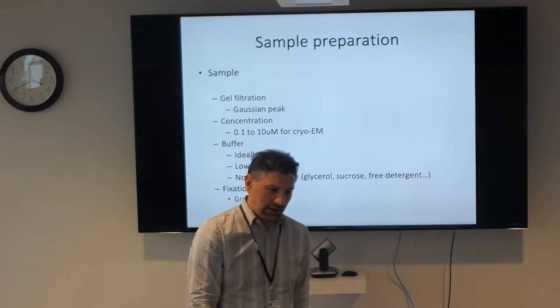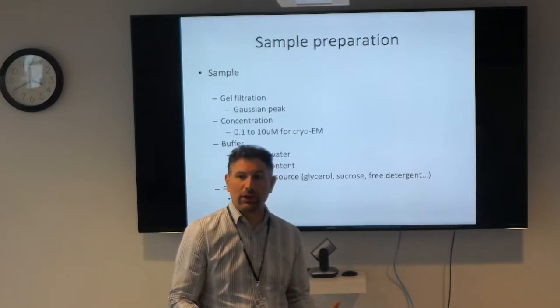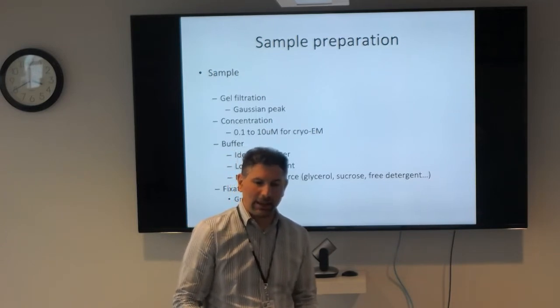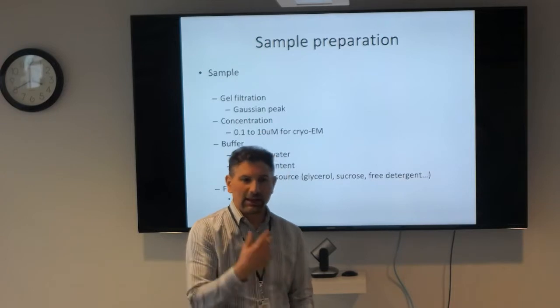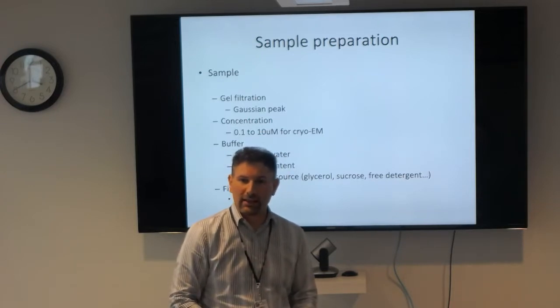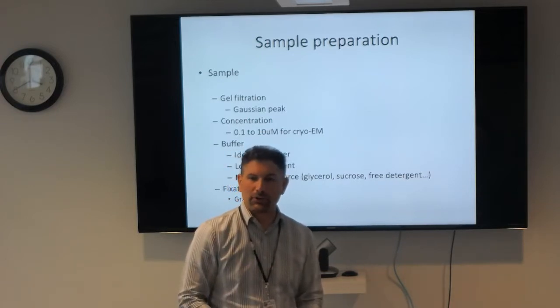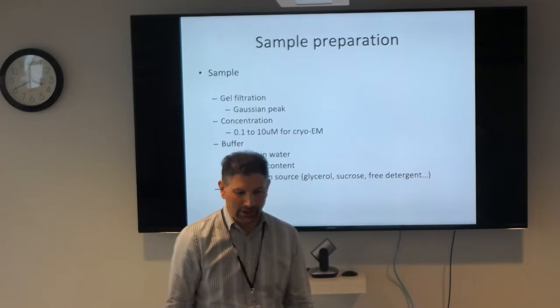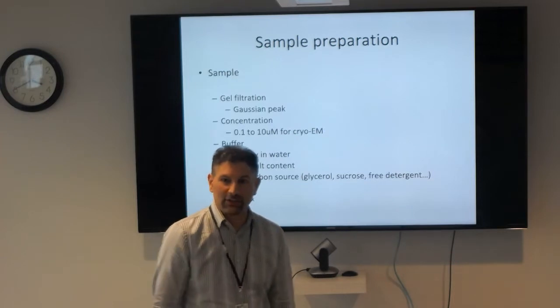So obviously in the beginning you've got the sample preparation. You want to make sure you have good sample. I know it's really easy, when you finally get some sample, to think, screw it, let's put it on the grid, let's see what it looks like, and let's just collect a million particles and I'll get this structure. Unfortunately, that doesn't work. I've been told that a bunch of times. I tried it myself. It just doesn't work.